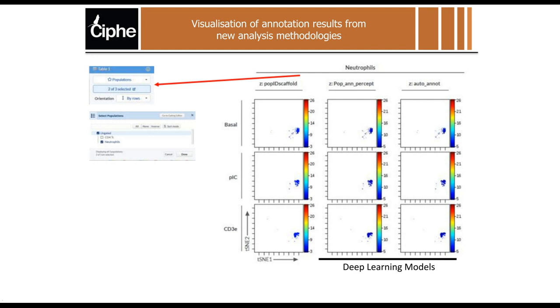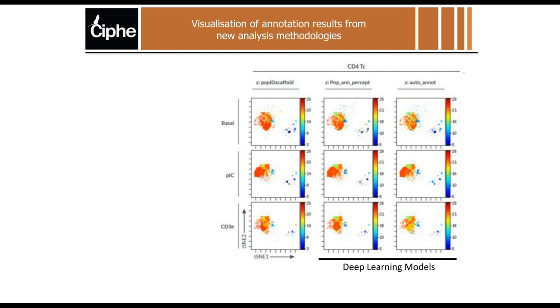So that was showing total cells. I can now select, because if I have done it before, I can identify my neutrophils by conventional gating, and then I can show only the cells within this population in my plot and see whether the annotation is homogeneous or whether I have one method that does not do a good job. So here we see it's each time blue, so it's each time the same type of cluster ID that is being shown. So I have an equivalent resolution about my method, about this annotation on neutrophils.